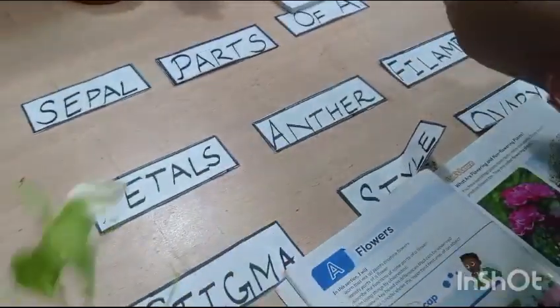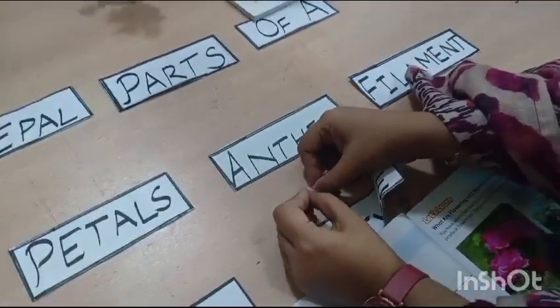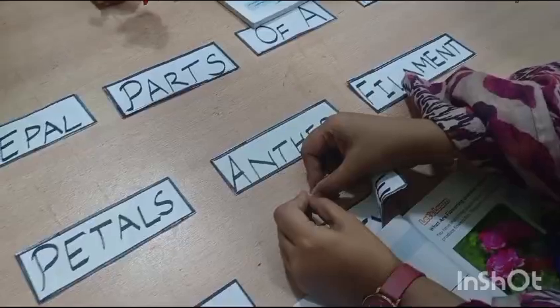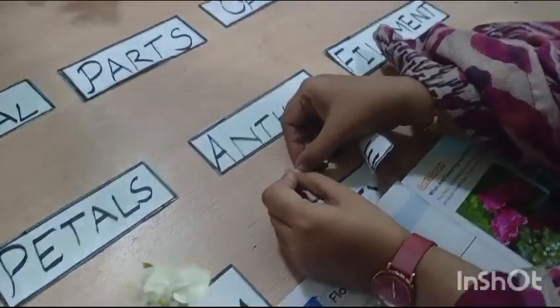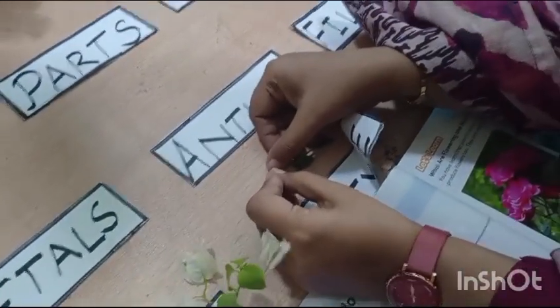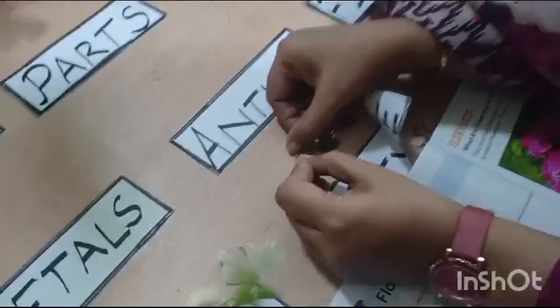Now you can see that after this, if we dissect the inner side of this part, hold the flower, you can see the internal parts of the flower.